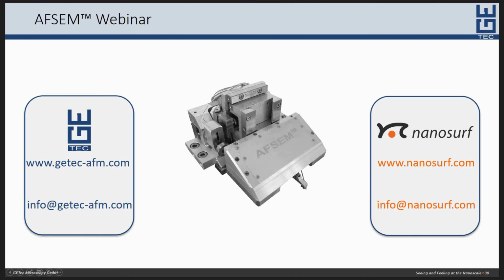the thing you might want to have a look at is the AFM phase, and the phase gives you information on the energy dissipation of the cantilever when it taps on the surface. So the phase might give you information that you have a different phase, let's say a tin oxide one or a tin one, and you might see a difference in the phase there, although you do not see any difference in topography. So it might be possible, of course, yes, but it depends on the sample.